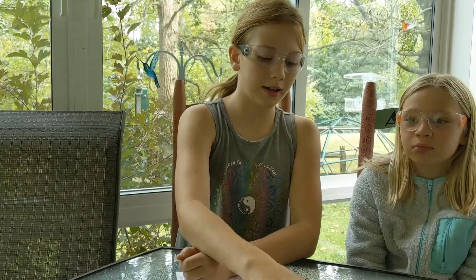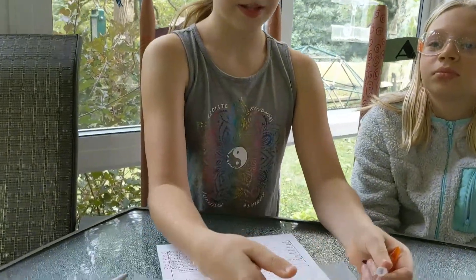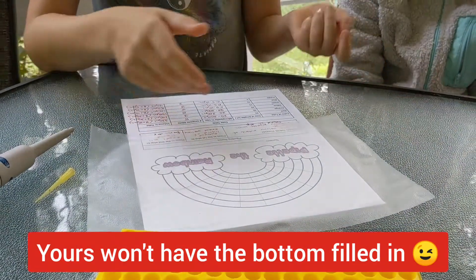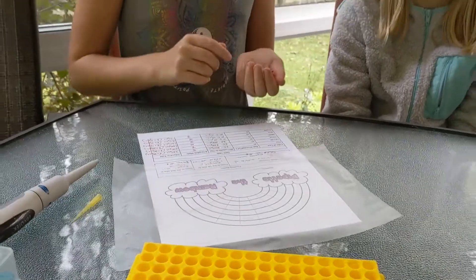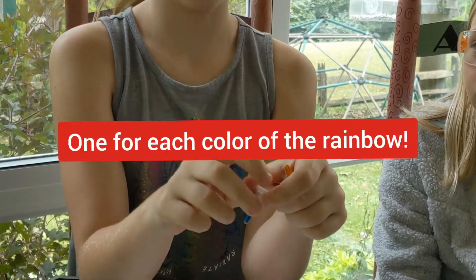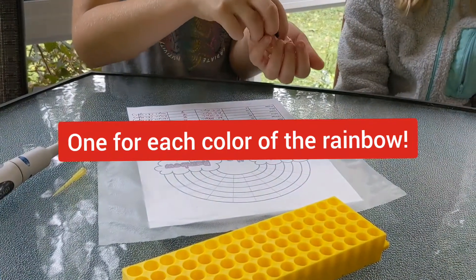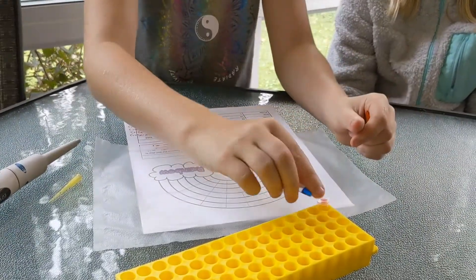We're going to be using a piece of paper that you can get from your teacher with plastic wrap around it to cover it. We'll also be using tubes full of color dye and we'll be putting them right side up so they won't tip over.